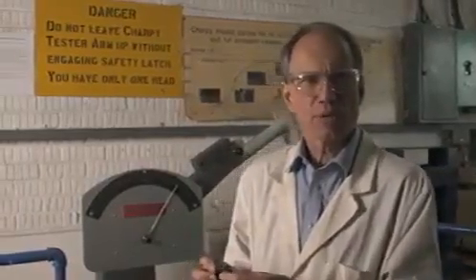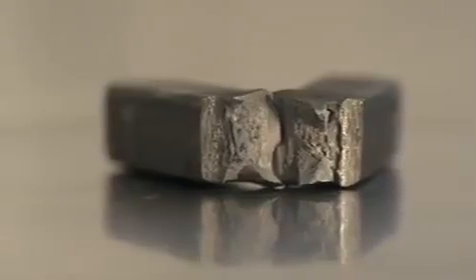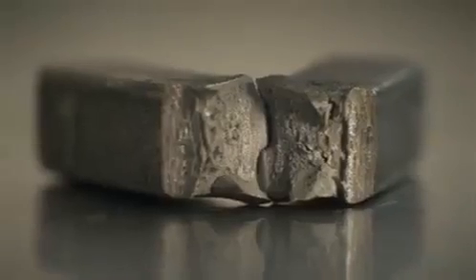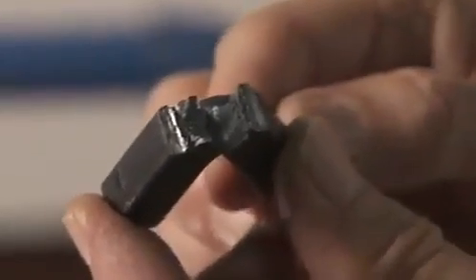The test piece flew out in front of the hammer. Once we've secured the hammer, we can recover the test piece from the ground. And here you see the one for the mild steel. That's fractured. Now begins the second part of the test, and that is to examine the fracture surfaces. It tells us a lot about how brittle or how ductile the material is.